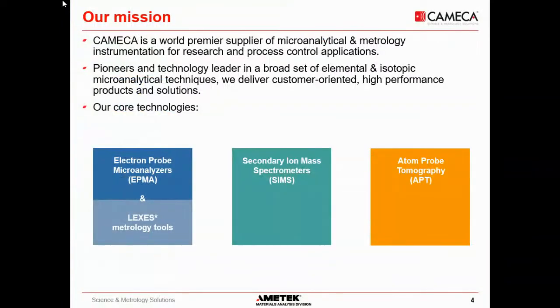CAMECA is a supplier of microanalytical instrumentation, which is mainly based on three main techniques: electron probe microanalyzers, EPMA, secondary ion mass spectrometry, SIMS, and atom probe tomography. This talk will be mainly focused on the SIMS technique.